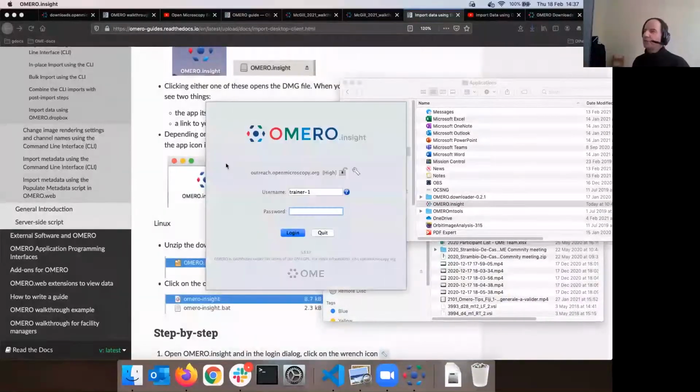On Windows, the situation is a little bit different. The exe file is easier to download and install if you don't have full powers on your computer. The other file available for Windows for download on OMERO.insight installs the Insight for all the users on the computer.